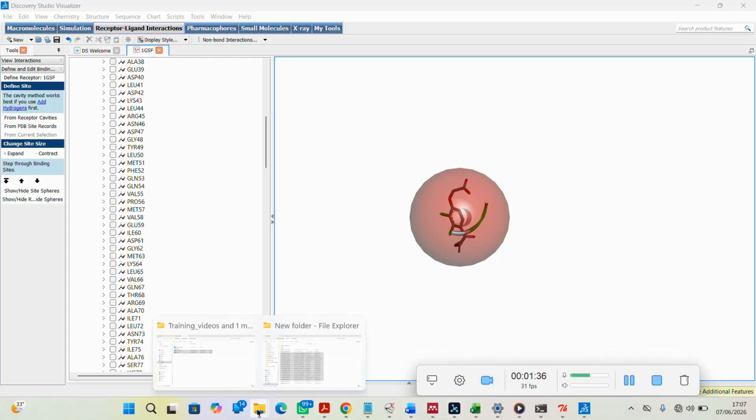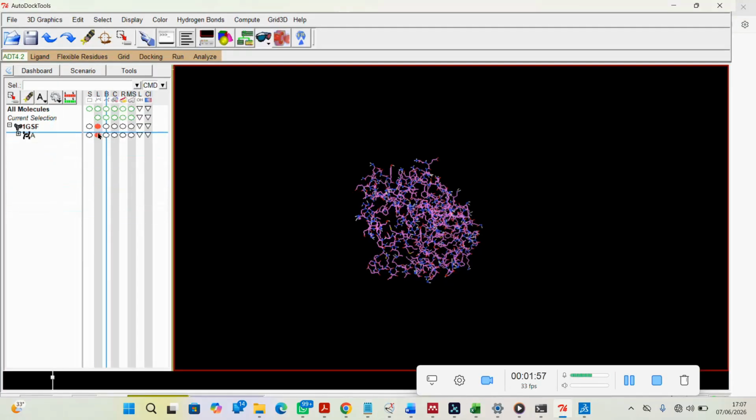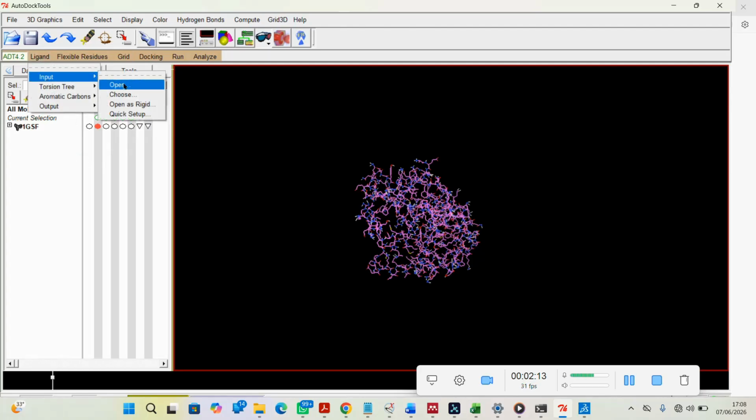We have also set our ligand now in Mol2 format. So we are making progress with our work. We also have saved or taken note of the binding coordinates, that's the active site coordinates. So we can come back now to AutoDock, and we already have our receptor here. So let's set the grid parameters. Or first, let's bring in our ligand so that we don't have to go forth and back.